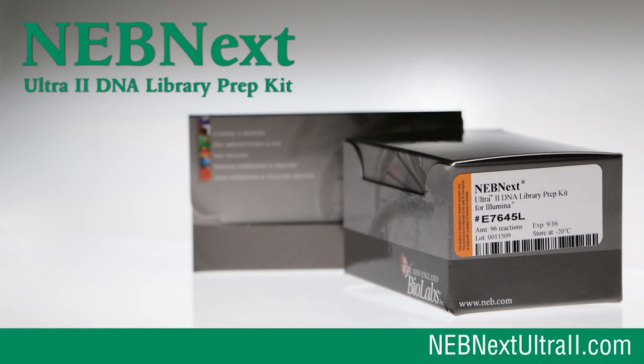For full details, see the manual for the NEBNext Ultra 2 DNA library prep kit for Illumina, which can be downloaded from our website. For any technical inquiries, please contact NEB Technical Support.